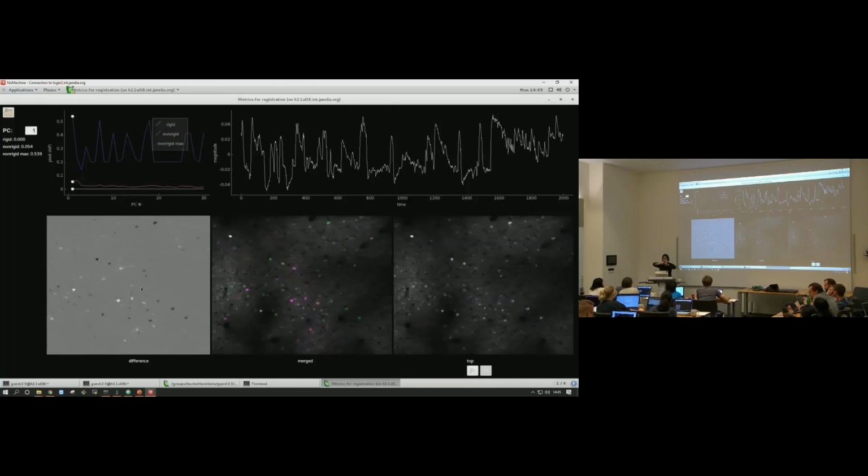Again, we took the principal component across time of this pixel by pixel thing, and that's this line shown here. Whenever this principal component across time is big, we take averages of those time points. So this time, this time, this time. These are all big. Take the top 100 time points, average those, and that's the PC high, we call it. And then the bottom 100, that's PC low. So the bottom 100 frames at this time.